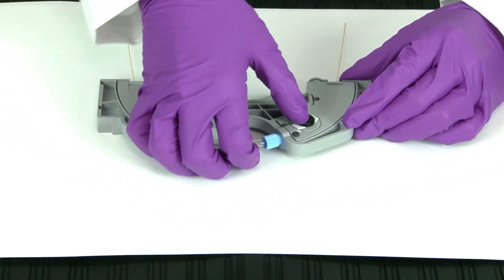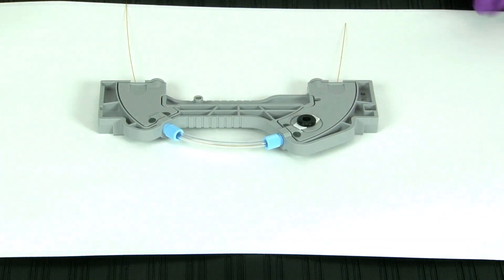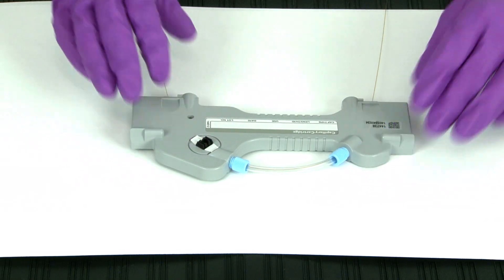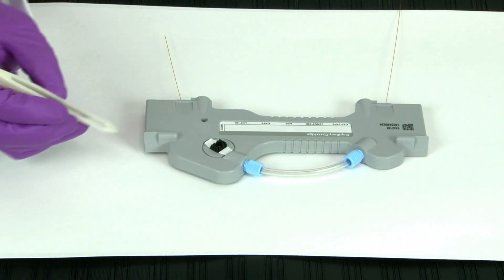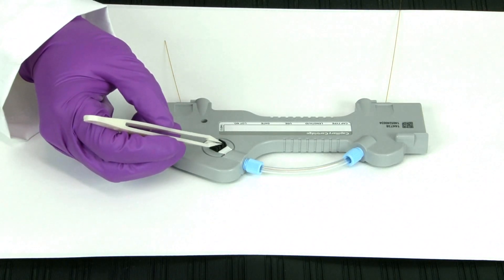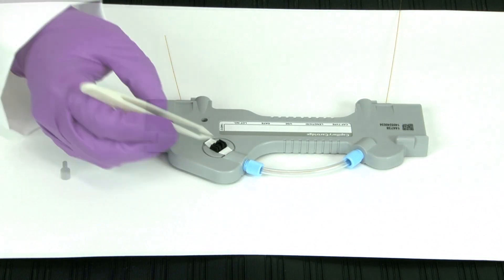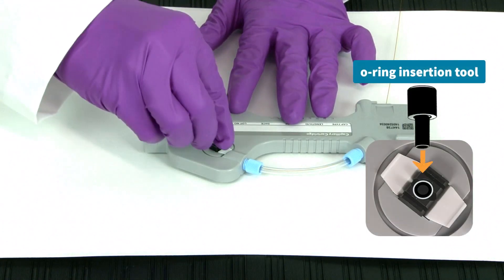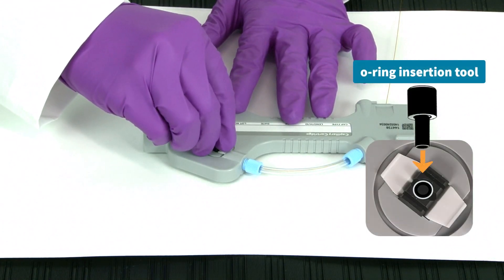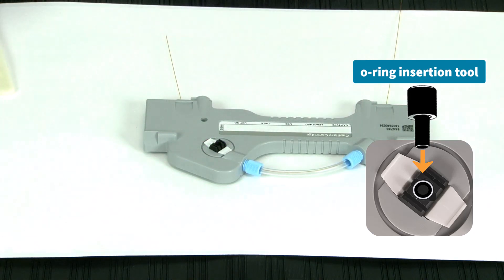Next, you will install your aperture o-ring. Flip the cartridge back over. Insert the o-ring into the front of the cartridge using plastic tweezers. Then push the o-ring flatly into the aperture hole using the o-ring insertion tool. This ensures that the o-ring is seated at the correct depth on top of the capillary window.